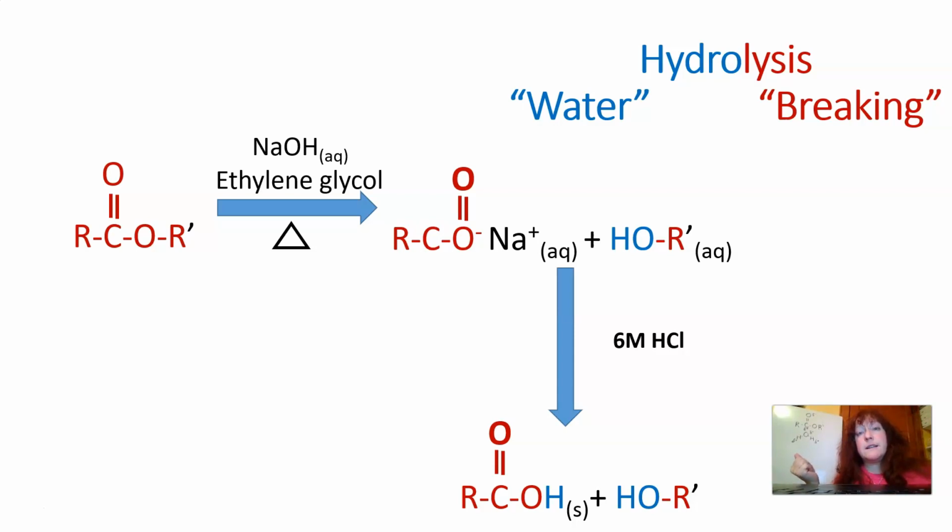The first is, instead of using just water, we're going to use sodium hydroxide, because that will totally fall apart in water. The fully charged OH group is going to attack much better than just a water molecule. In addition, we're going to heat it up to give it energy for the reaction. We're going to do that through a reflux, which you've just done for the ferrocene experiment. So we are going to boil it in solvent at a particular temperature for 30 minutes and get the most amount of product. By doing it this way, we are going to first create a carboxylate salt here.